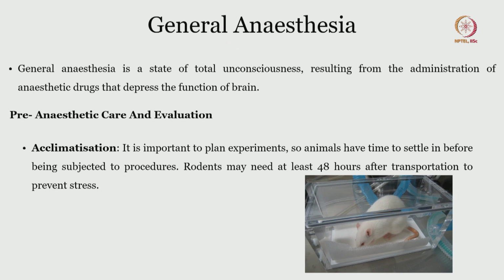So briefly, let us have a good walkthrough on the general anesthesia aspect, where you really need to have a state of total unconsciousness. So pre-anesthetic care and evaluation is really significant to have this sort of outcome and result. So choosing the animal and taking care of all these steps, which are simple and doable steps, will give a really good outcome.